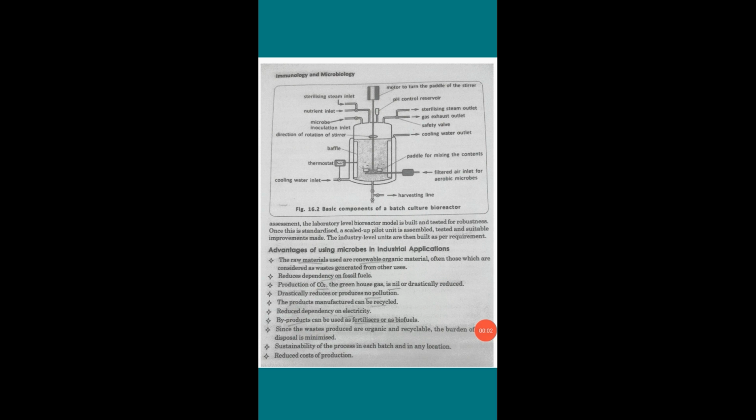Dear students, we can have a discussion on the bioreactor. You might have heard about the nuclear reactor in which nuclear reaction takes place to produce nuclear energy. But in a bioreactor, microorganisms act on so many nutrients and bring about the production of some products at industry level.